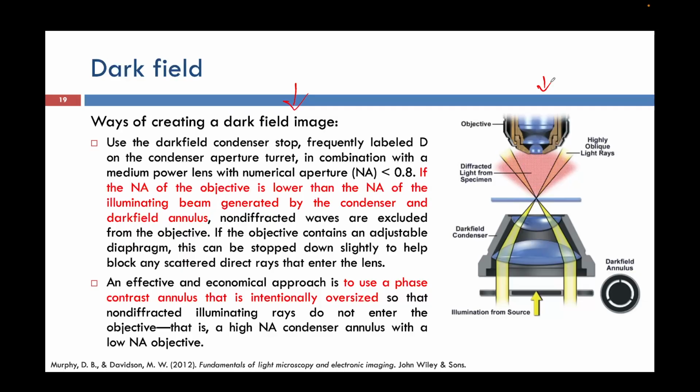That is a little bit tricky, right? So how we will do that? In general perception, let's say we are keeping our lens like this, and this is our sample, and beams are coming like this. Incident beam, this is our sample, and these are the non-deviated rays, right? And these are the diffracted rays. This is how we have perceived our sample currently.